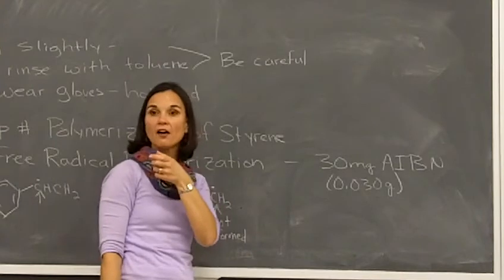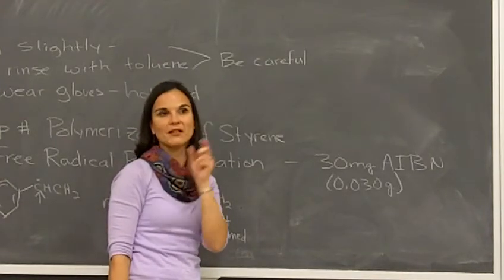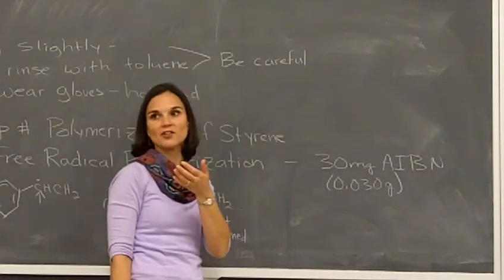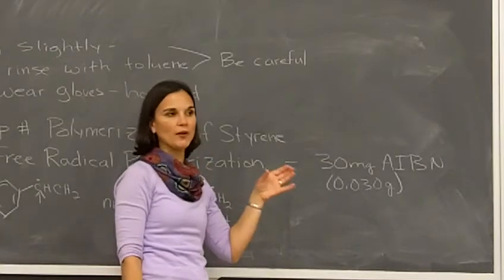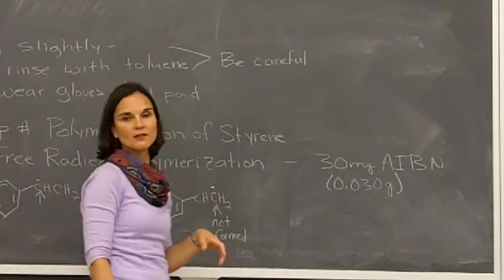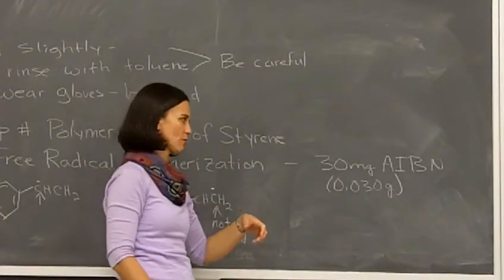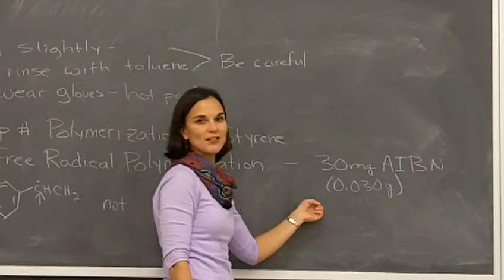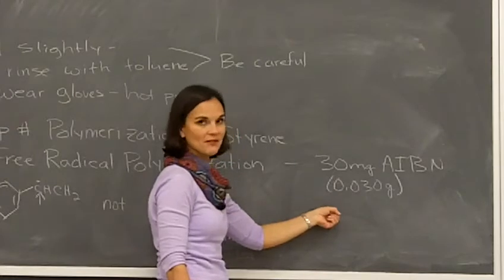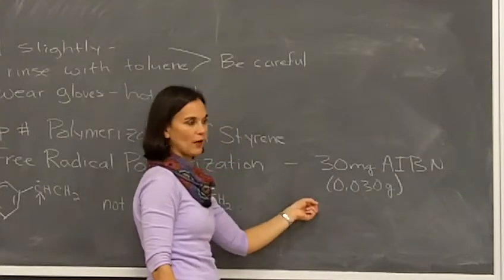You'll get a lot of polymer, but it'll be really short polymer because it is what is starting that chain reaction. And if you get lots of chain reactions started with your styrene, you're not going to form very long polymer strands. You're going to have all short polymer strands. And so we'll talk about in a minute what that will mean as far as isolation, okay? So you want your polymer strands to be as long as possible, all right? So make sure you use only 30 milligrams of AIBN, not any more than that, so 0.03 grams.